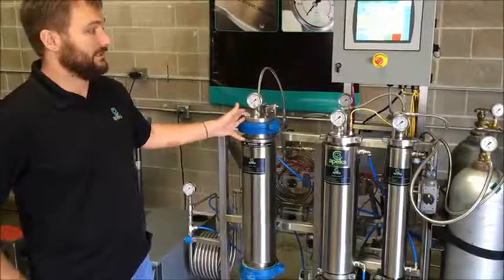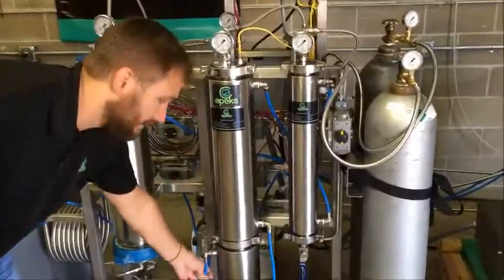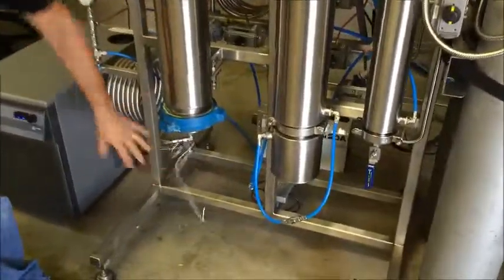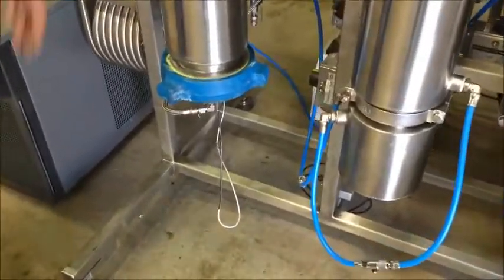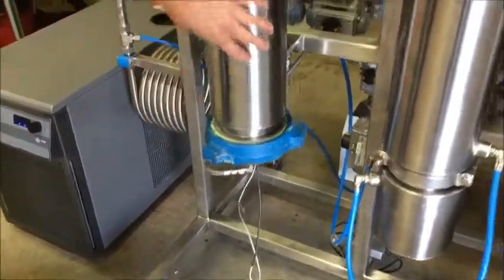The 2,000 series system, just like any other system, comes with three components. You have your system itself, where your material will go in and where the extraction will take place. You have a chiller, which maintains temperature throughout the system. All these vessels are jacketed, so we have water running through every single one of these vessels — that's what these blue lines are for.